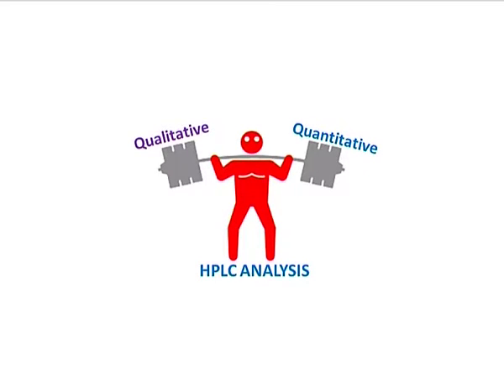Now, what do we mean by qualitative and quantitative purposes? You remember a typical chromatogram, right, which mentions a typical retention time, TR, for a given peak that we had seen in the previous lectures. Now, if a chromatographer is able to maintain all the conditions of a chromatographic experiment constant in HPLC, which means that the stationary phase used should be the same, the type of mobile phase used should be the same, the pressure generated should be the same, all the conditions remaining the same.